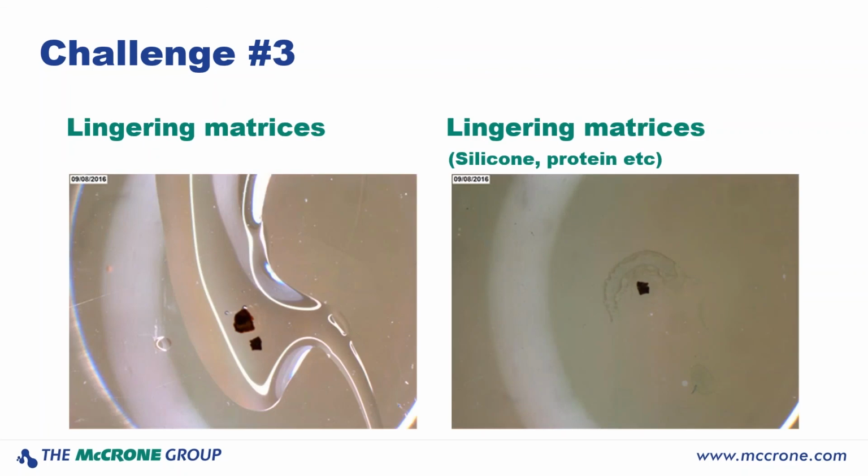I'm going to talk for a minute now about what I like to call the lingering matrices. When I mentioned earlier filtering some liquids, there are certain liquids and components that just really like to stick around. When we fish a particle out of a liquid matrix, we're going to rinse it off and wash away any of that lingering liquid. Obviously, we don't want it contributing too much. There are some materials, though, silicone, which I mentioned earlier, and protein, which we might find in cellular-based drug therapies, which just really like to hang out and stay on your particles.